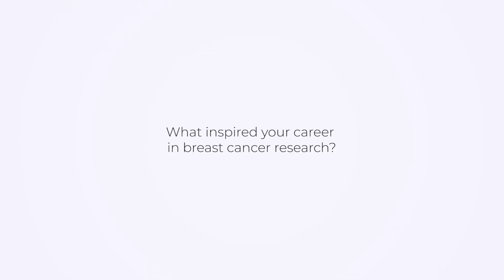I'm Laura. I have recently graduated from a PhD degree at the University of Zurich. My research was in breast cancer, specifically studying tumor microenvironment. And what really drew me to that research was actually the method used, which is imaging mass cytometry. And what was attractive for me about the method was that it's a very computationally challenging method.